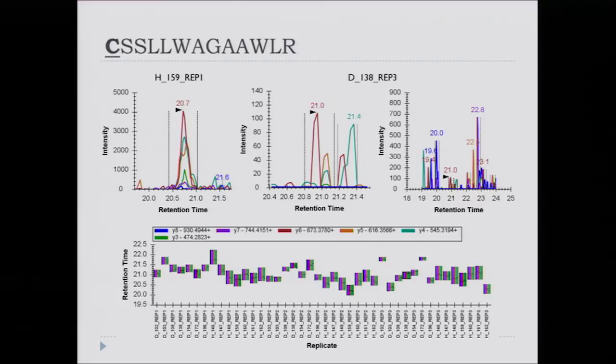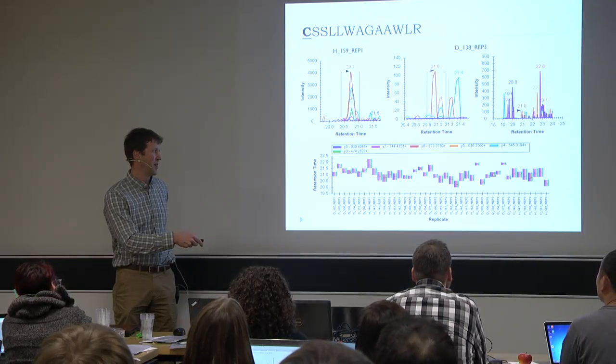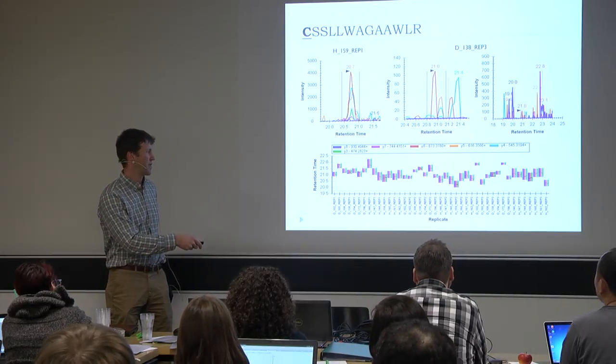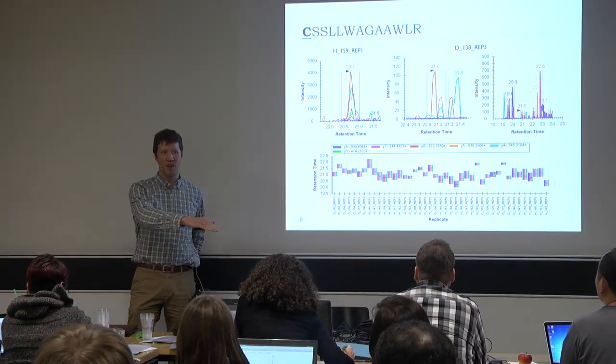So this now is the acquired order. This is the order that the samples were acquired in. It's very easy to achieve in Skyline, just a right click and you can choose from a menu. And I was disappointed to see this order because while it does have cycles, you can see that all the diseased are measured, all the healthy then measured, all the diseased measured, all the healthy measured, all the diseased measured. In fact, 102 is the first disease, 102 is the first disease, 102 is the first disease. So it's exactly the same order in 3 cycles.